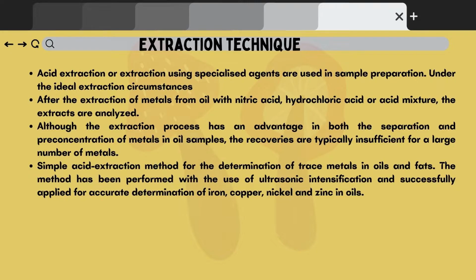Although the extraction process has advantages in both the separation and pre-concentration of metals in oil samples, the recovery is typically insufficient for a large number of metals.